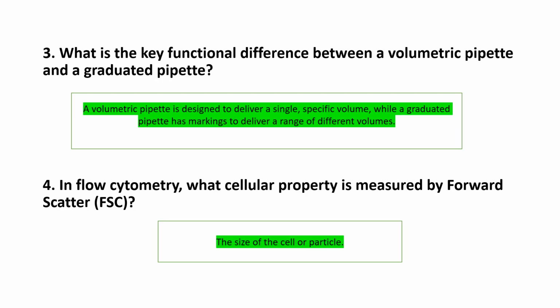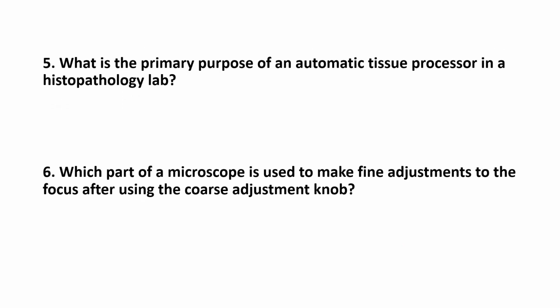Right. So let's proceed to question number 5 and 6. So 5, what is the primary purpose of an automatic tissue processor in a histopathology lab?